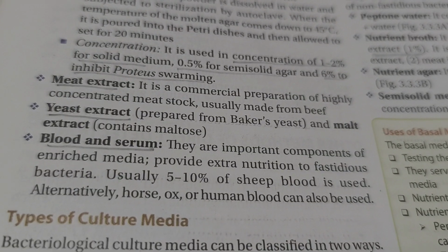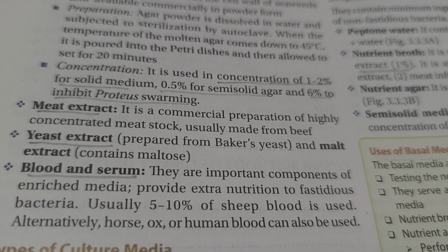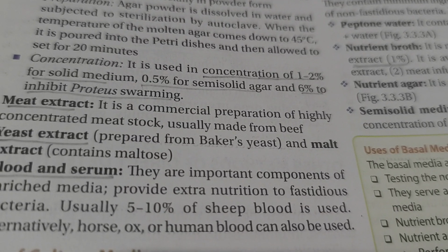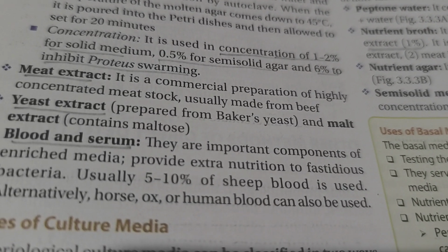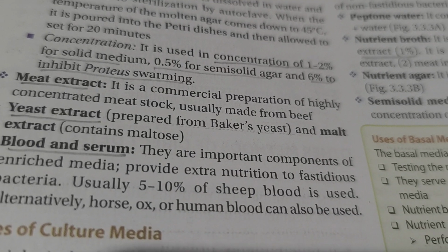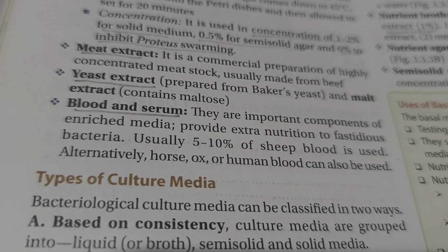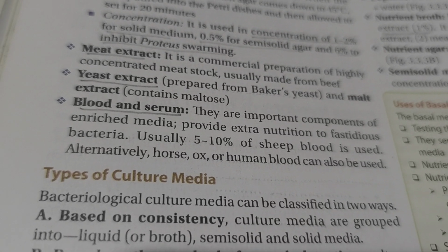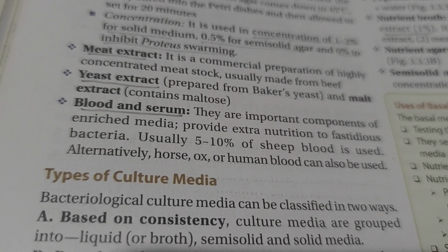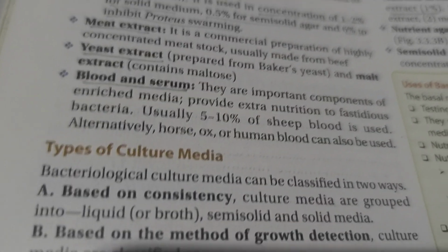It is used in a concentration of 1 to 2% for solid medium, 0.5% for semi-solid and 6% to inhibit swarming. Meat extract. It is a commercial preparation of highly concentrated meat stock, usually made from beef.